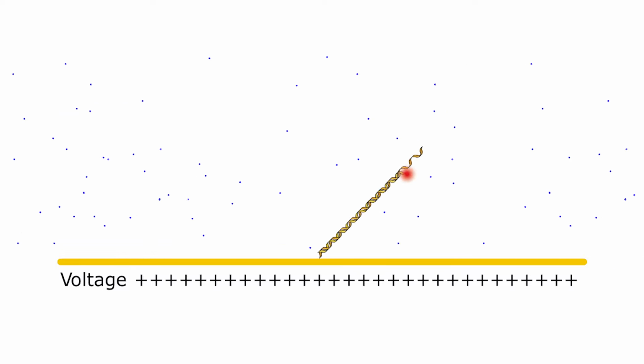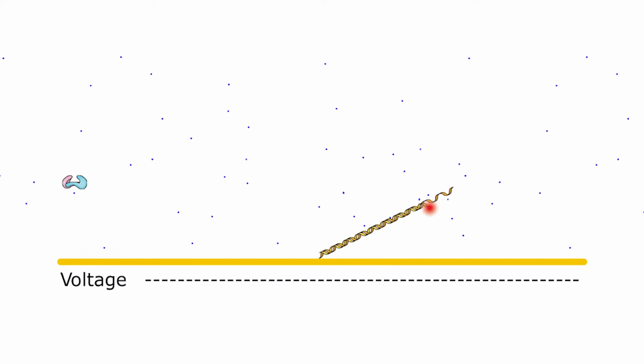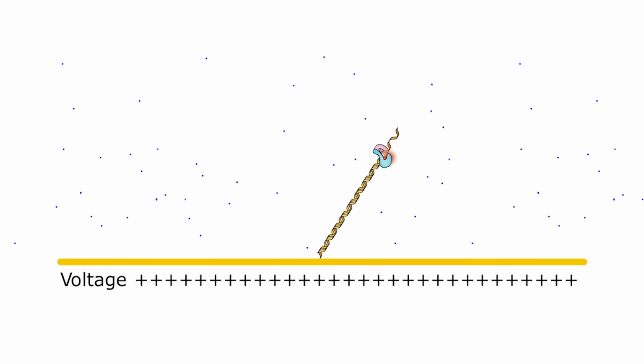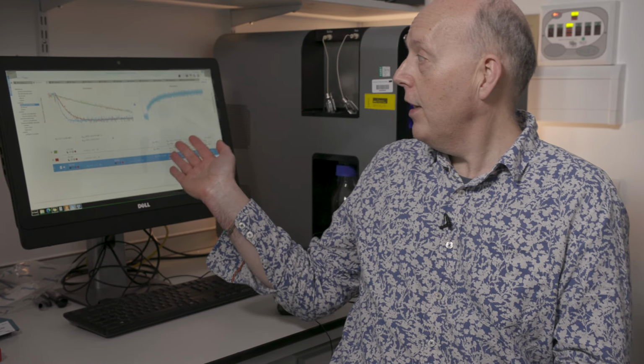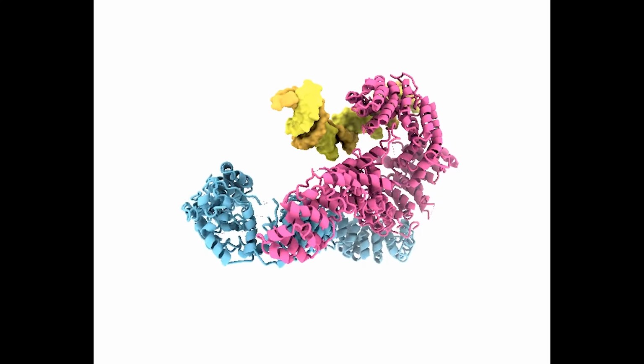And this switches very, very quickly. So if anything binds onto the DNA nanolever, then that will slow down the motion and we can detect the binding and look at the kinetics. The data here shows the interaction between the DNA clamp and the DNA nanolever. That was the first time we could actually detail the kinetics and find out that it was a really tight binding. But more importantly, it didn't come off very quickly. It was very, very slow to come off. And so that was probably why it was quite good at doing its job at searching. It could bind onto the DNA and then slide along the DNA to try and find the DNA damage parts.